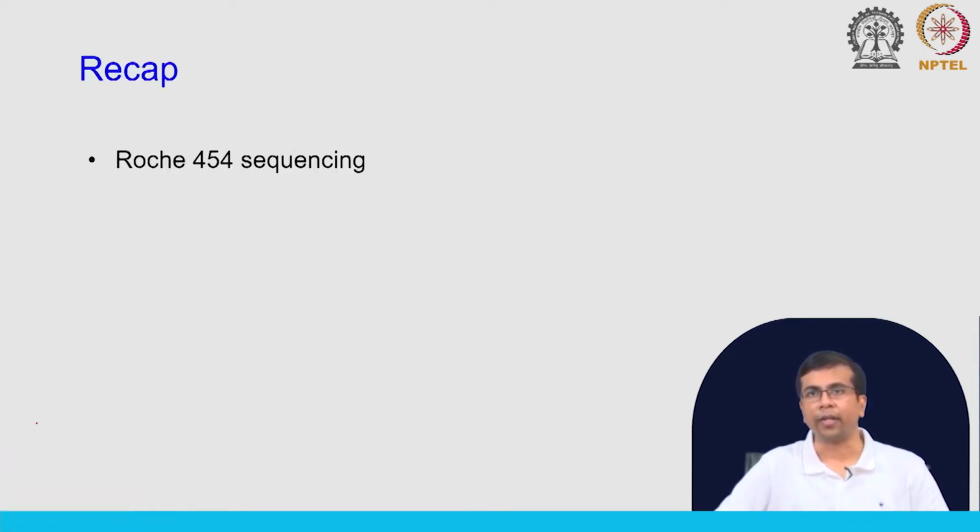So, just to briefly recap what we have discussed so far, we have talked about 454 sequencing, and 454 depends on pyrosequencing, right. If you remember the principle of sequencing, we have this DNA polymerase, and when a base is added to the growing strand, there would be release of pyrophosphate. Now, this pyrophosphate is finally converted to ATP, which in the presence of the luciferase enzyme and luciferin will give rise to a signal of light. This light is detected by the detectors that are present, which then does the base call.